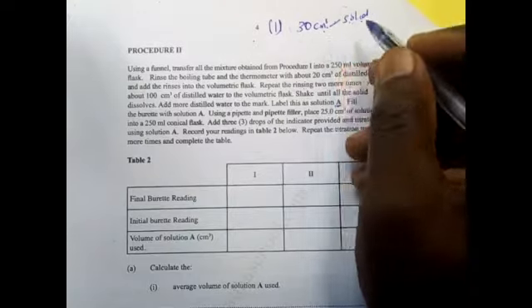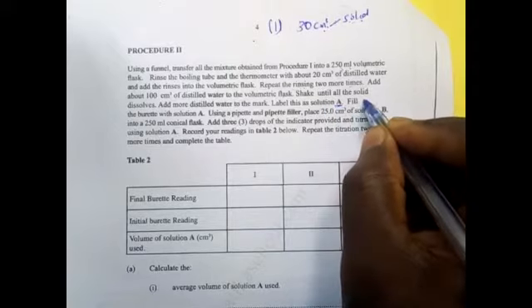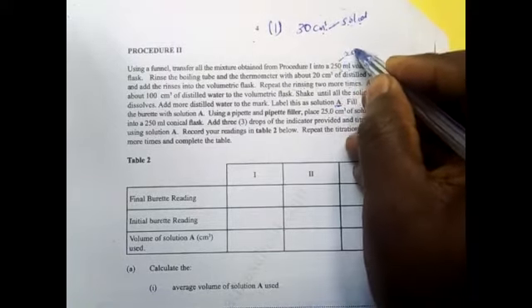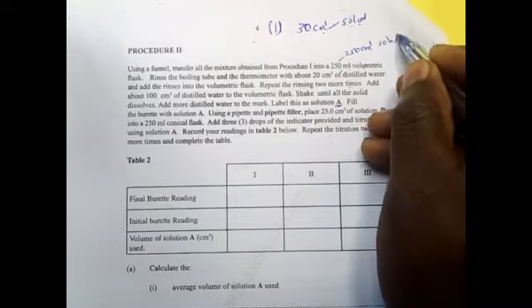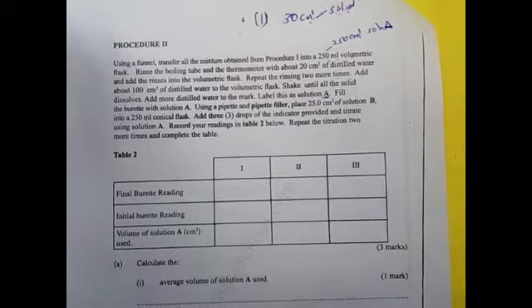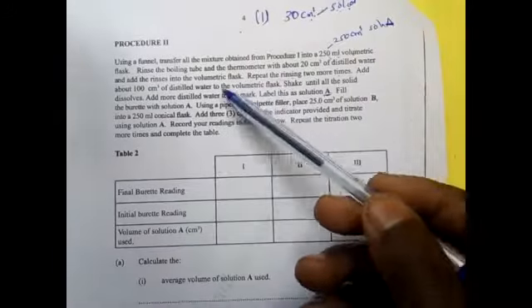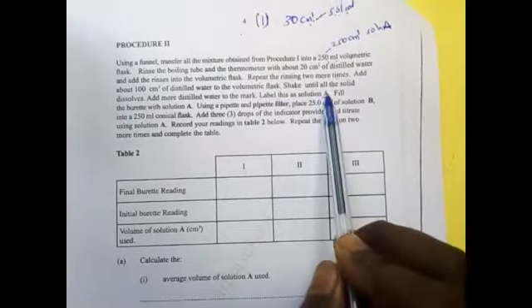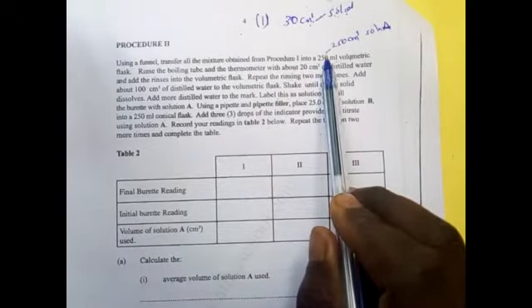So here we are going to prepare solution A, which is 250 centimeters cube of solution A. Very important to understand that. The final thing we have done is we have prepared solution A, in 250 centimeters cube.